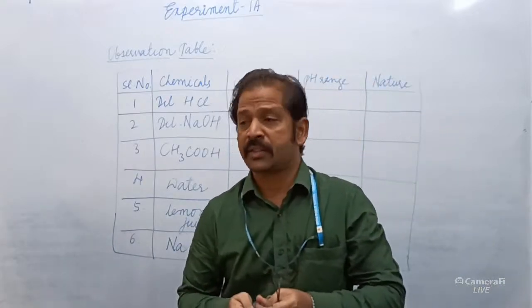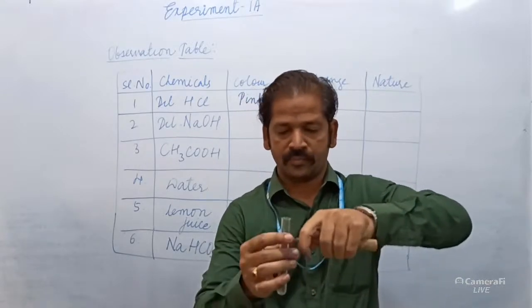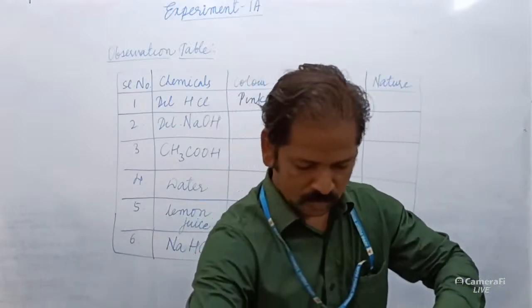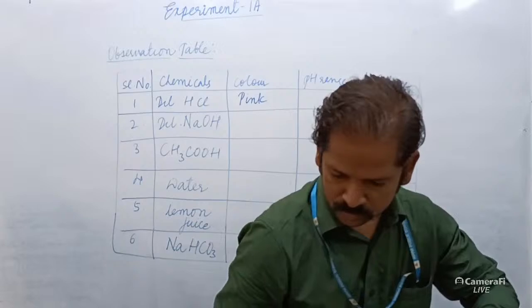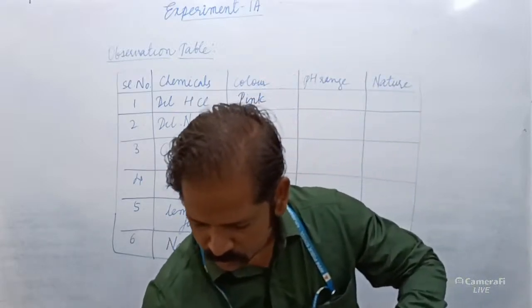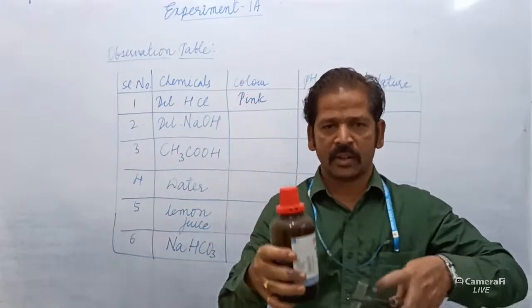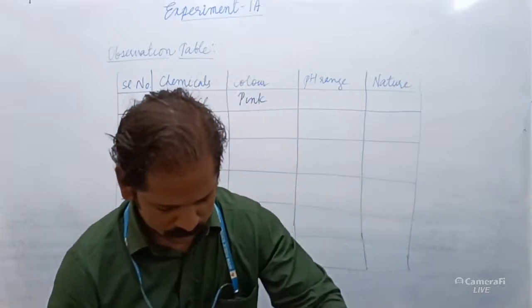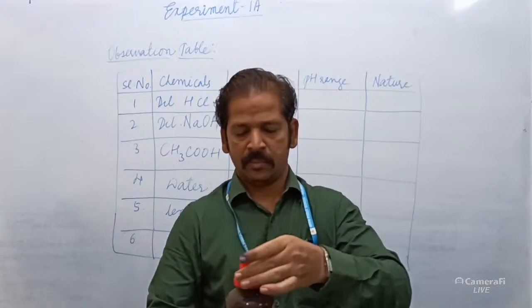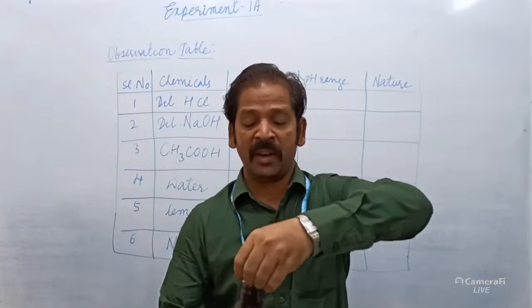The third chemical is acetic acid. Yes, it is a glacial acetic acid solution. But handle the solution with care, because this chemical has an unpleasant smell.